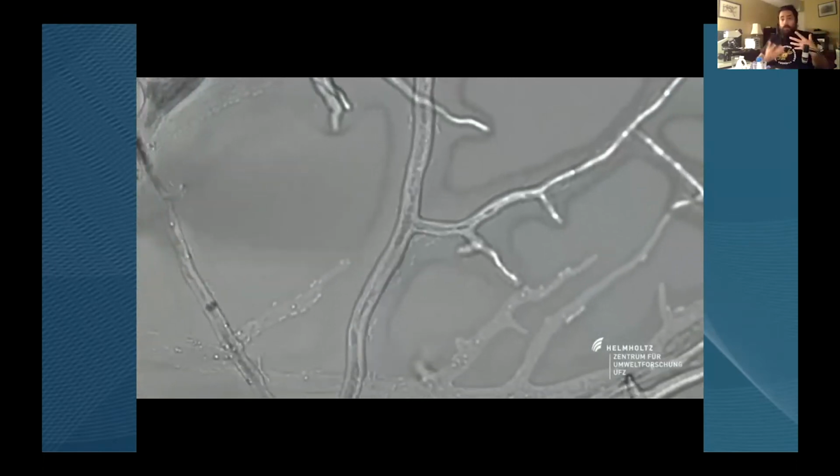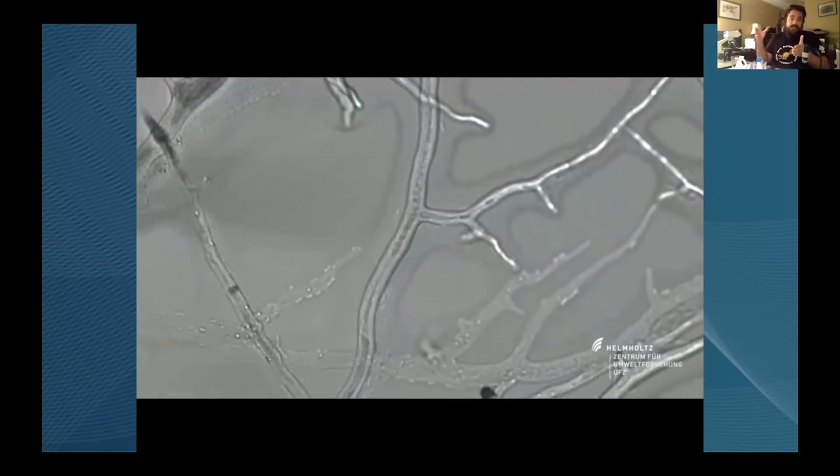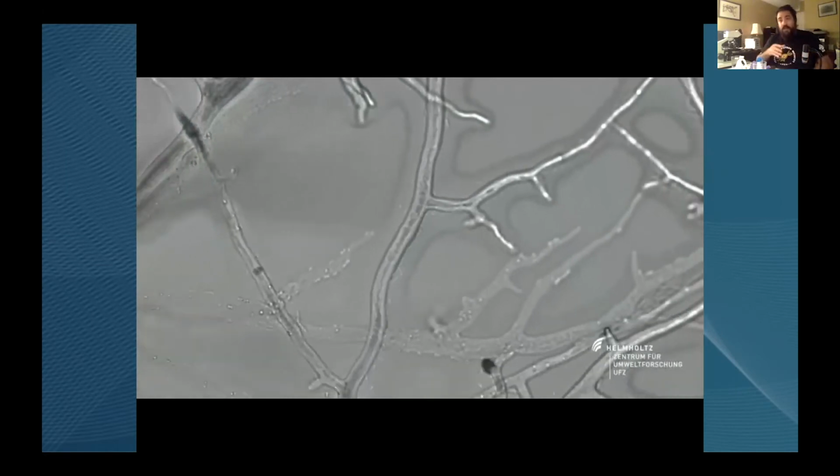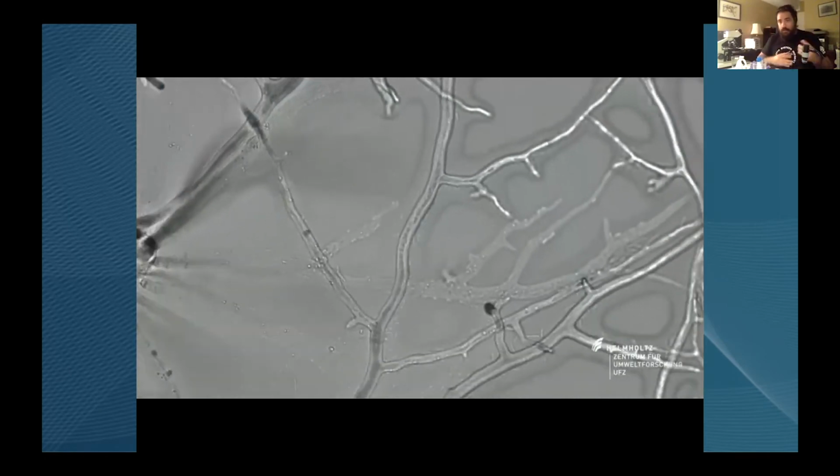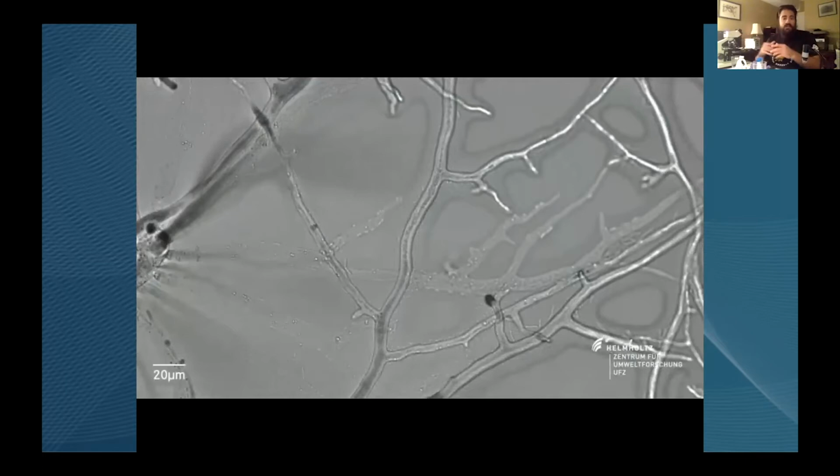This is incredibly important because, as we understand in more advanced ecologies, the further the succession, the more fungi there are, and they're facilitating these relationships and connections. So it's kind of interesting that at a certain point, in these advanced ecologies, it becomes like a singular mycelial map. It's pretty amazing, especially in these older growth systems. So it's pretty wild.